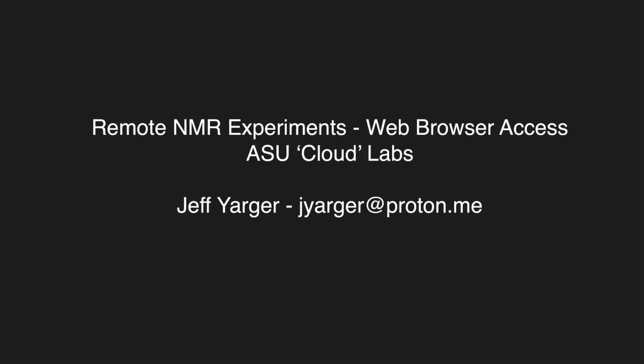ASU's Magnetic Resonance Research Center has remote NMR experiment access via web browsers.